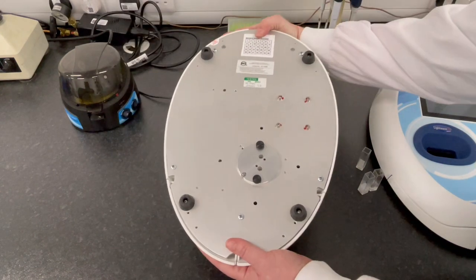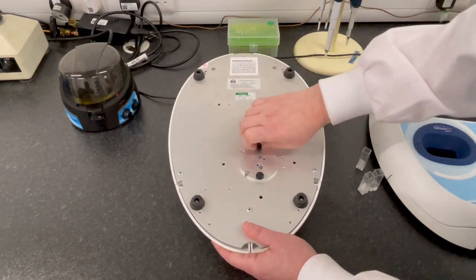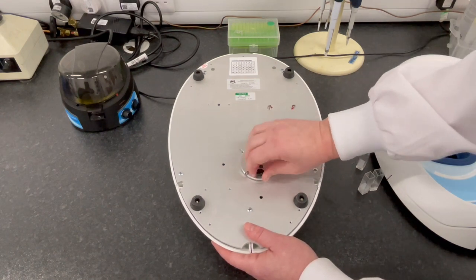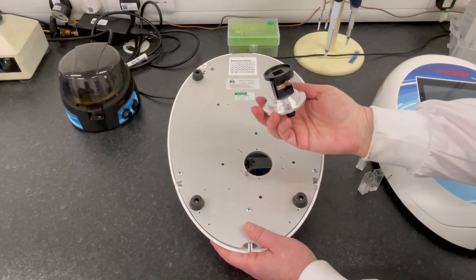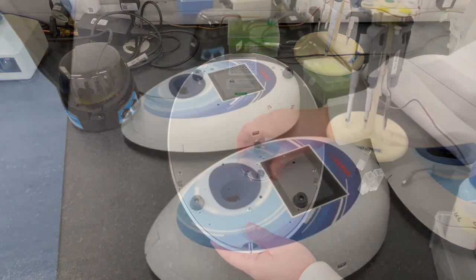Powerful and precise enough for high-end research, the easy clean sample ports, as well as the lightweight and portability of these spectros, makes them robust enough for even the most hardcore teaching labs. They can even be stacked for compact storage.